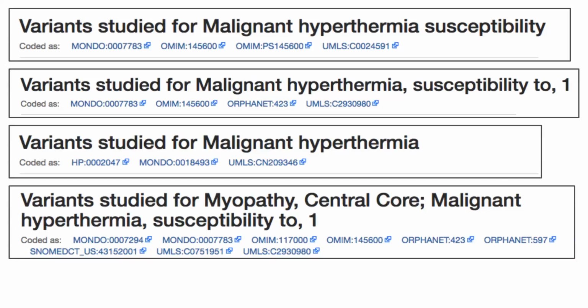Because there's this issue with conditions, I think it is more helpful to be doing these searches starting by a gene of interest instead of a condition, unless your condition is so specific that every ClinVar submitter uses it the same way. Otherwise, you would only be looking at a subset of all the data that you are probably interested in, as opposed to all the variants within that gene. So just a heads up about using conditions for filtration and looking at ClinVar data.